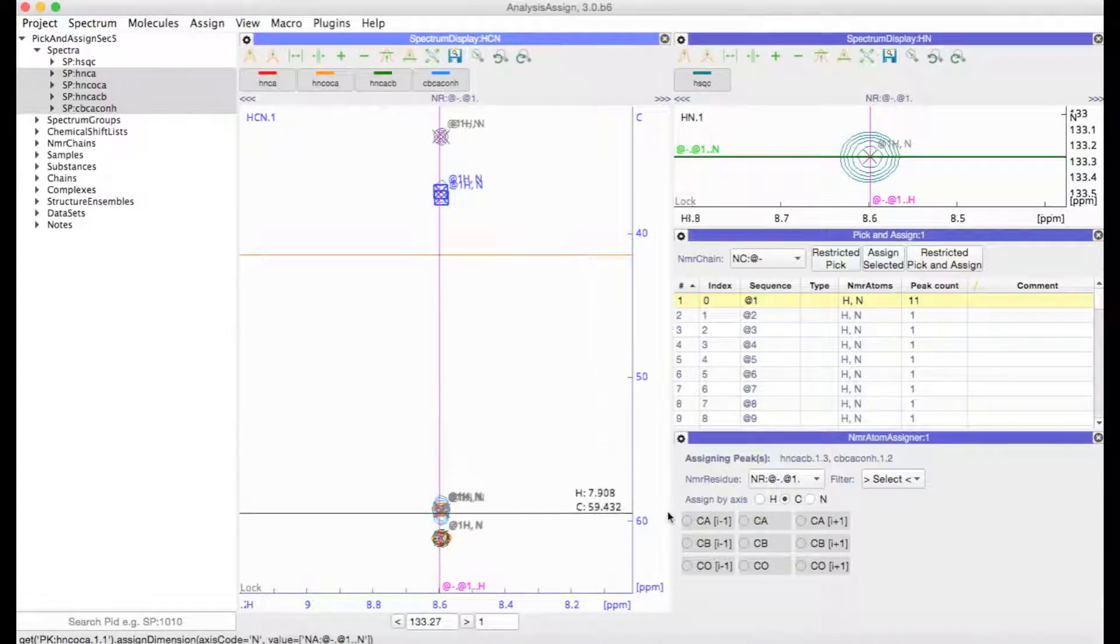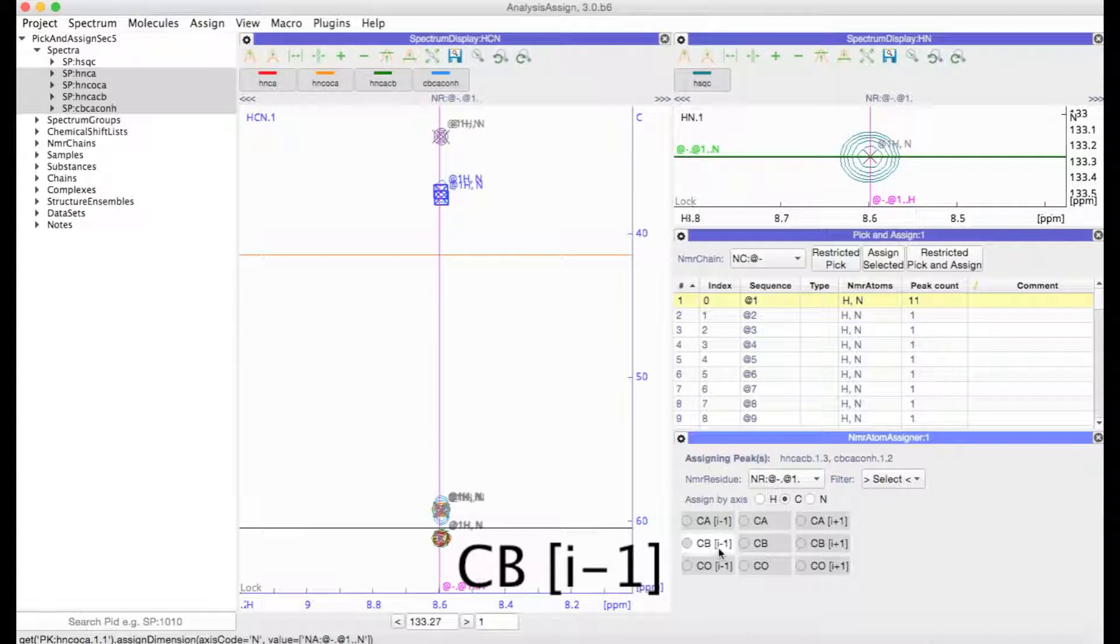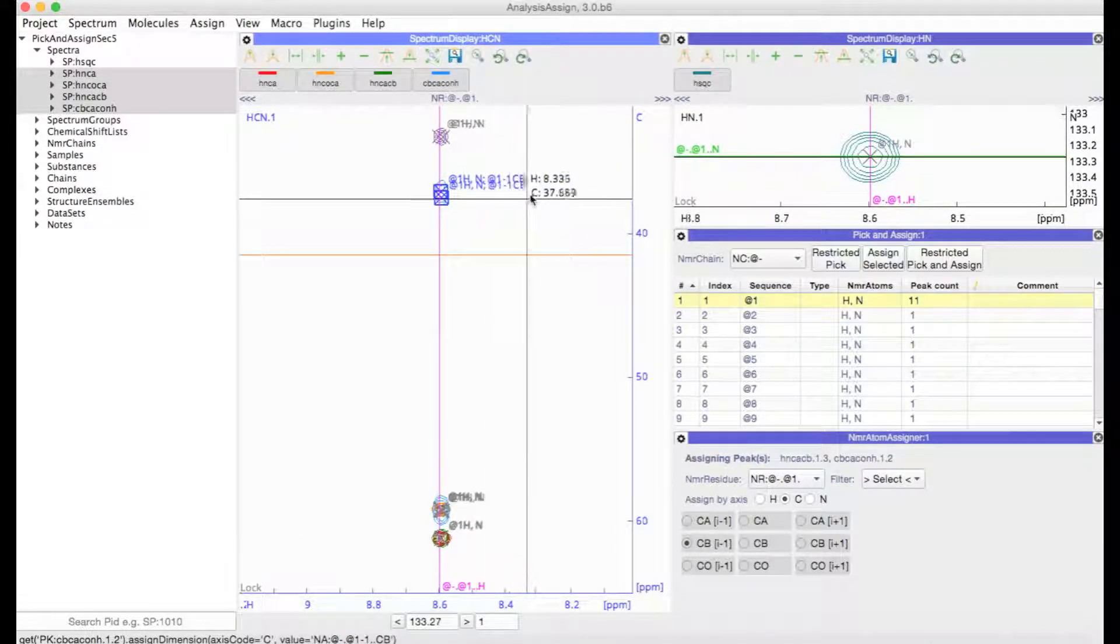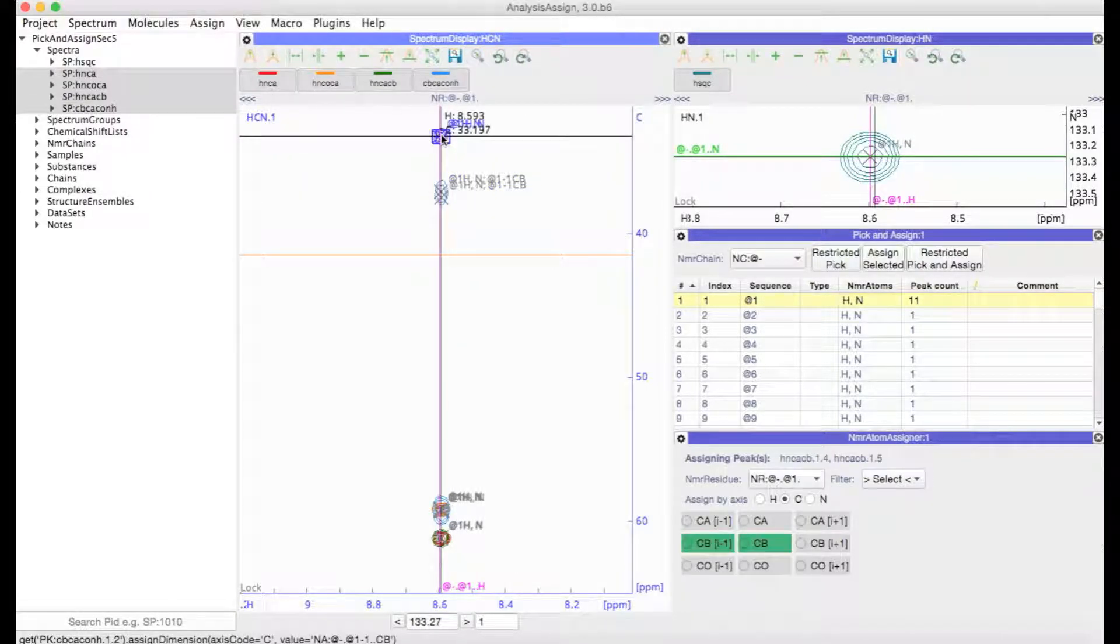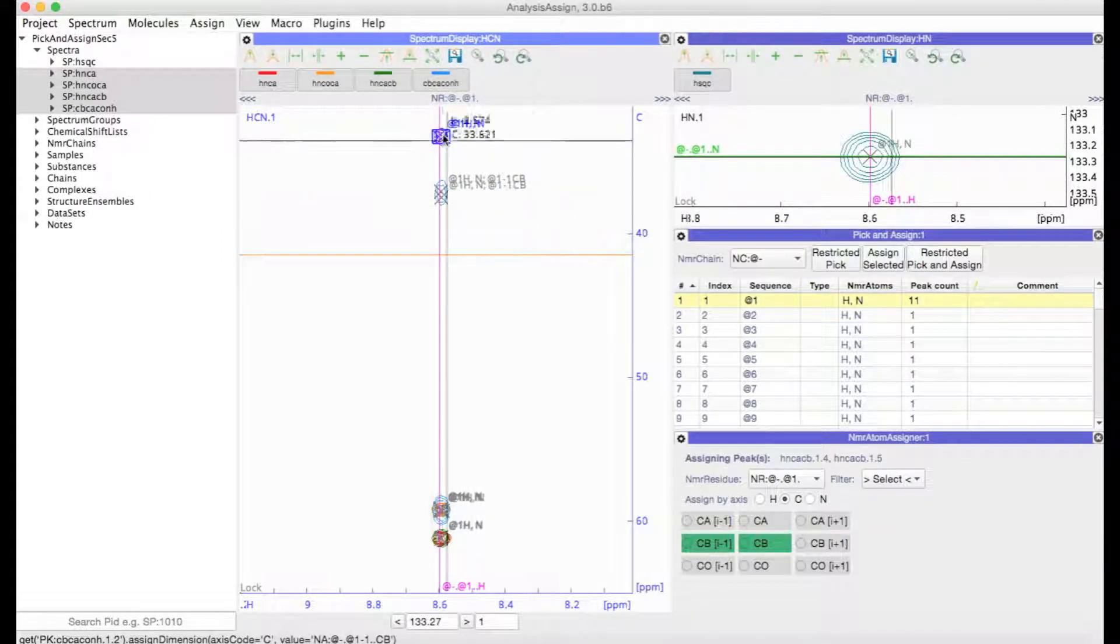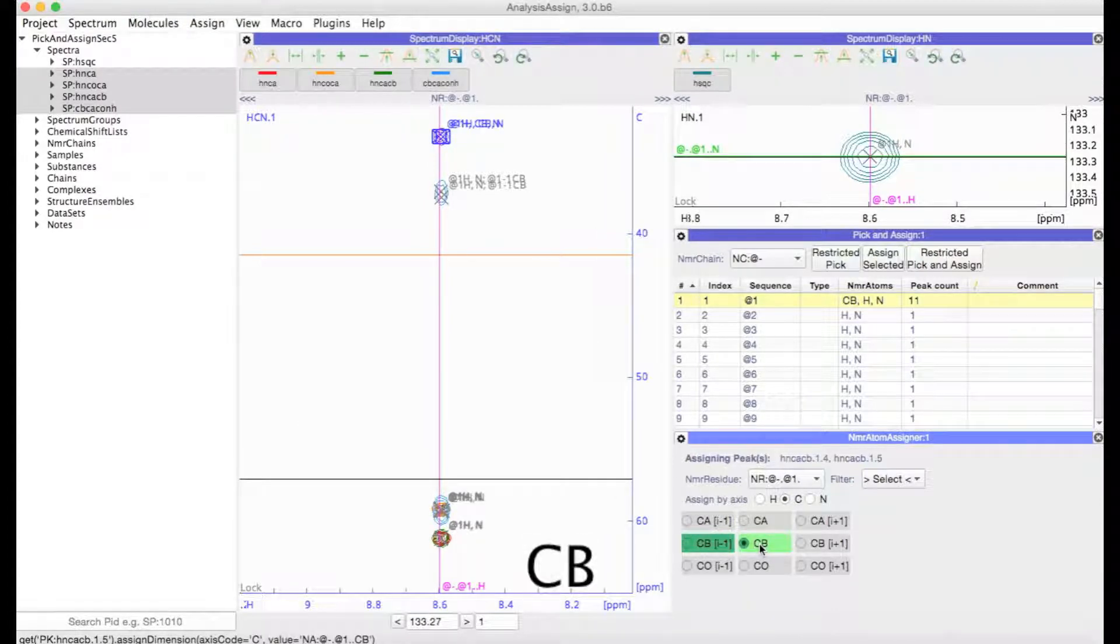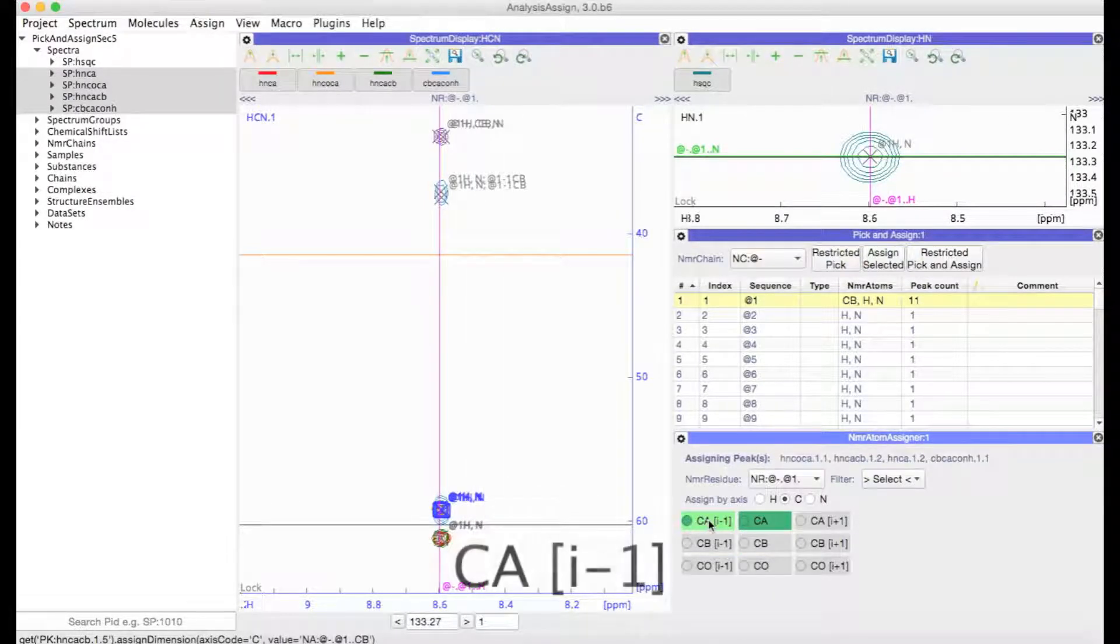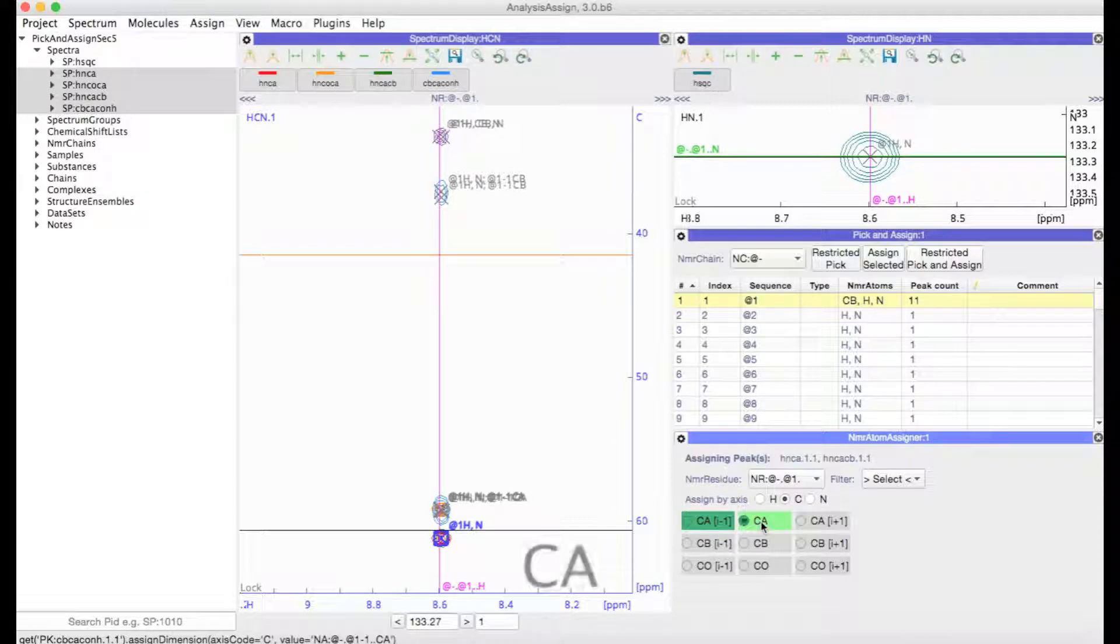So that's why I'm going to select down here in my NMR Atom Assigner CbI-1. And now those NMR atoms have been added to those peaks. Then this peak must belong to the CbA of the same residue.